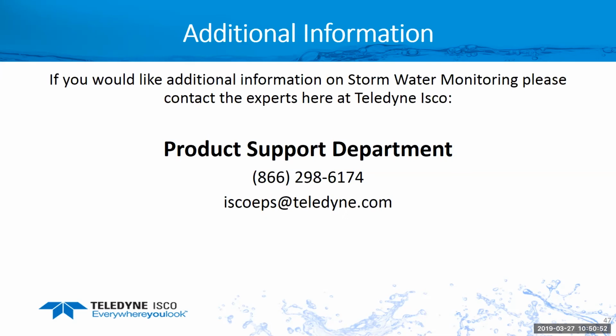Bubblers use a pump motor. They take a lot of power also. So I don't know if I'd say huge power requirements. Again, that's all relative to what you're comparing it to. If you're comparing to a submerged probe, absolutely. Ultrasonic, absolutely. But if you're comparing to a bubbler, they're pretty much on par. Or if you're comparing to a mag meter, pretty much on par.